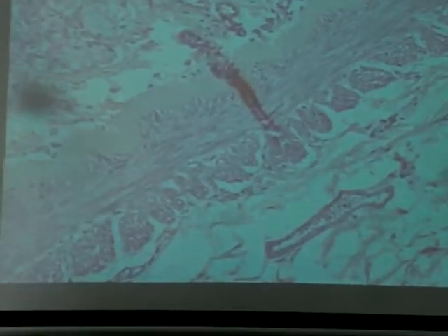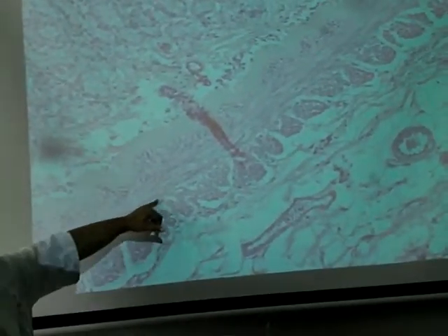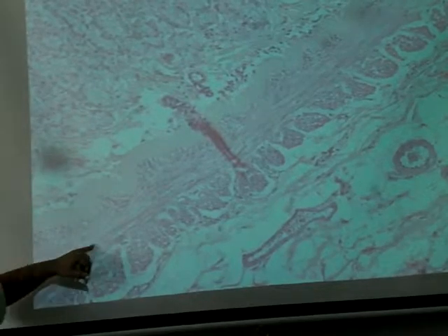You can see here, it doesn't have a huge muscularis. You're going to notice on some of the other digestive organs, this layer is a lot thicker than this. But this will be the actual muscular layer, or muscularis layer. I am not going to ask you if it is circular or longitudinal, so you can omit that part. Just be able to identify the layer as muscularis, and that it is comprised of smooth muscle.